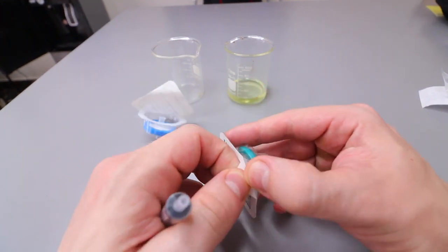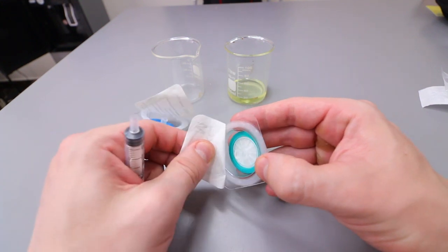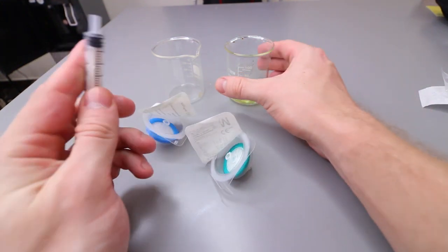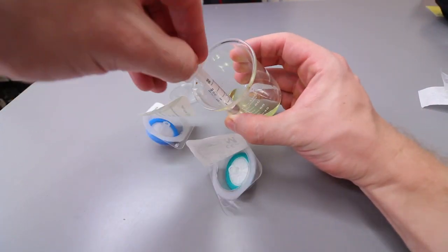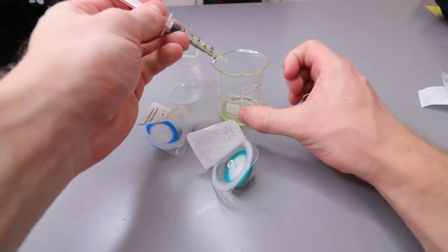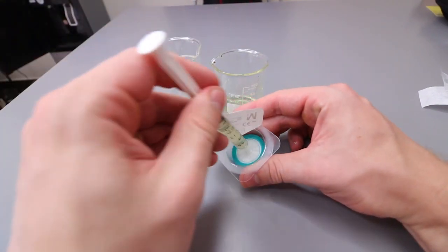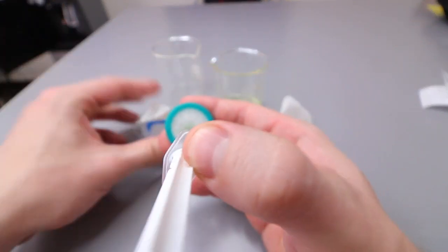I'm going to do a quick comparison. Obviously if you were going to be filtering your gear you should be doing this in a little bit more of a sterile environment, but I just want to show you the difference between these two filter types. So the first I'm going to use is a slightly more expensive filter that we sell.